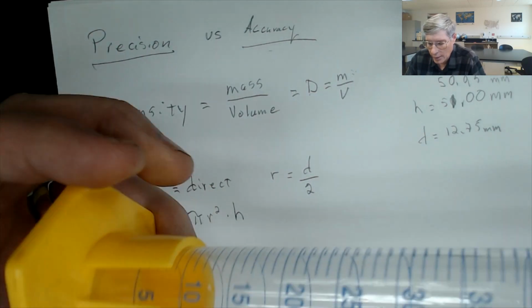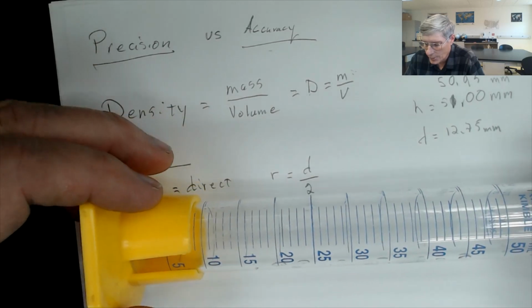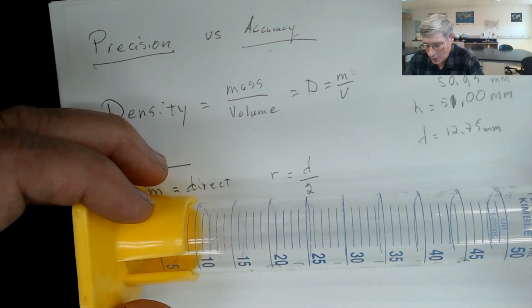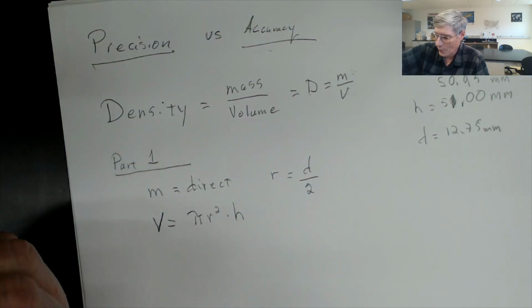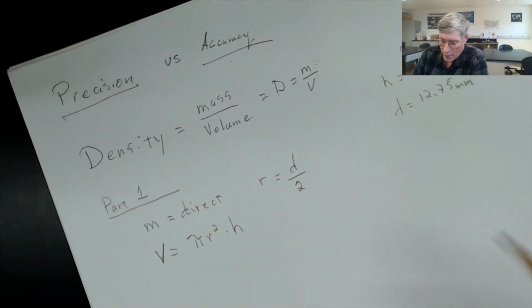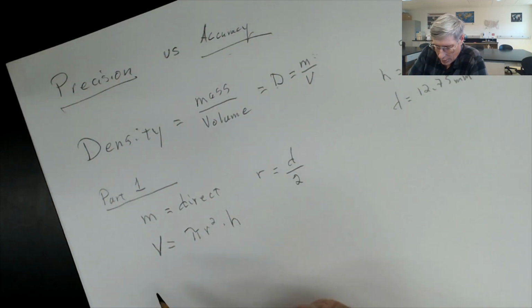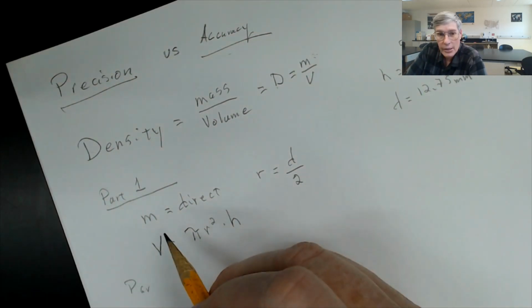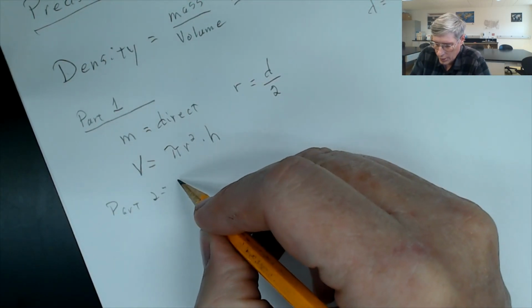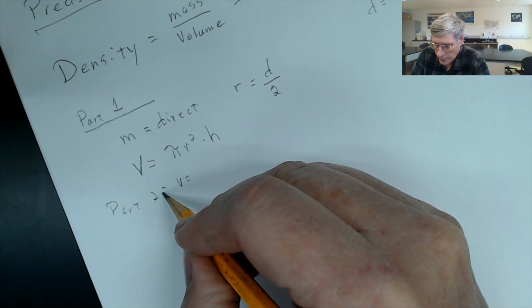So again, the point of this lab is, can you obtain correct significant figures or the correct precision in all your measurements today. Okay, so let's now go to the calculations. And so part 2, let's just make a little comment. We're going to do water displacement for volume.